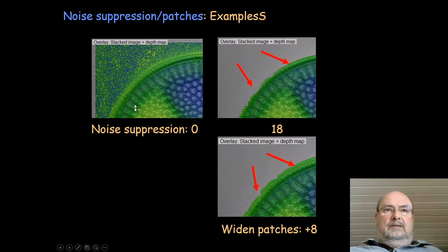This is another diatom. Noise suppression 0: noise. Noise suppression 18: it's fine here and here, but here we've lost some information about the diatom. We could make this value lower or we could widen the patches, then this will get a little bit wider. It's a compromise, and you're actually able to combine the results, the maps, and the stacked images finally to get the perfect result at the end.